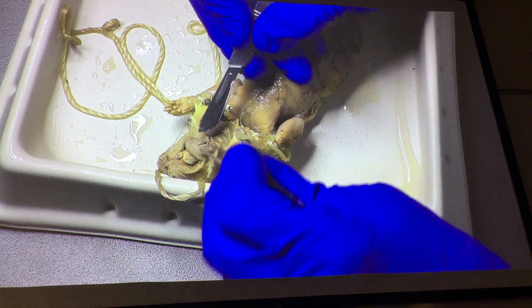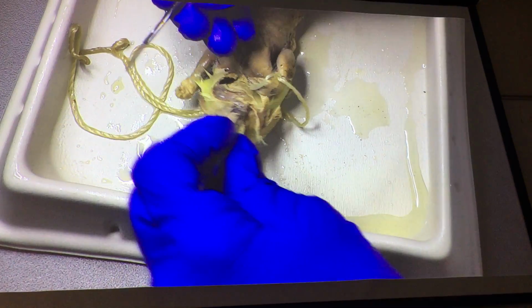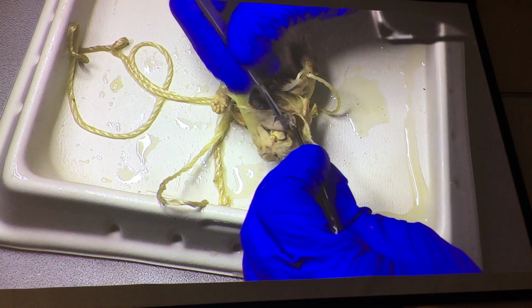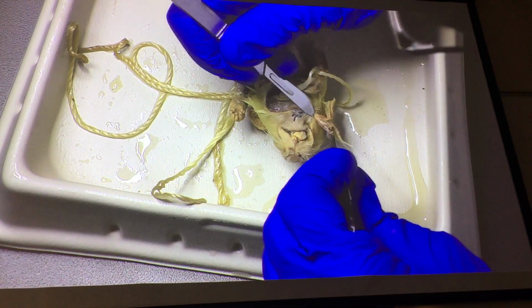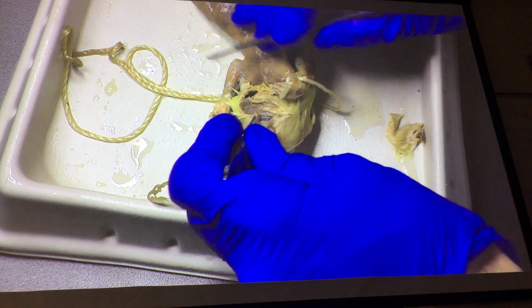One of the interesting things about these rats is that they have a little difference in their muscles than what we have, or even the cats that we normally dissect. Let's see, Amanda knows about this actually. She could tell us all about it.